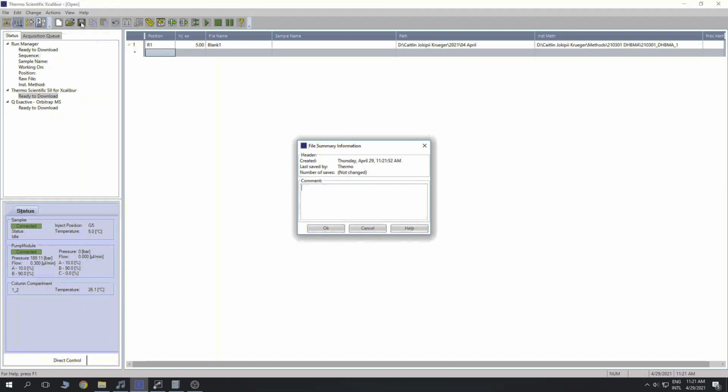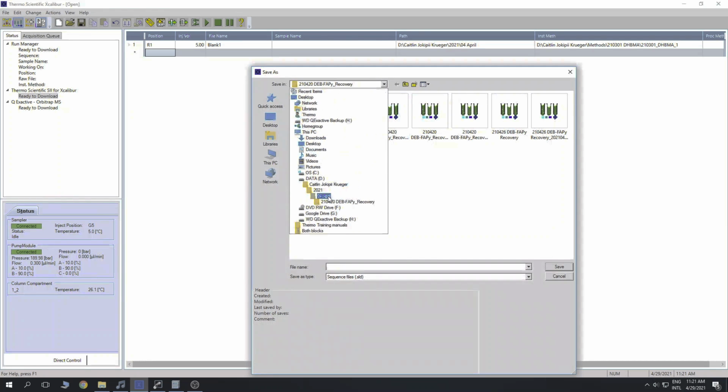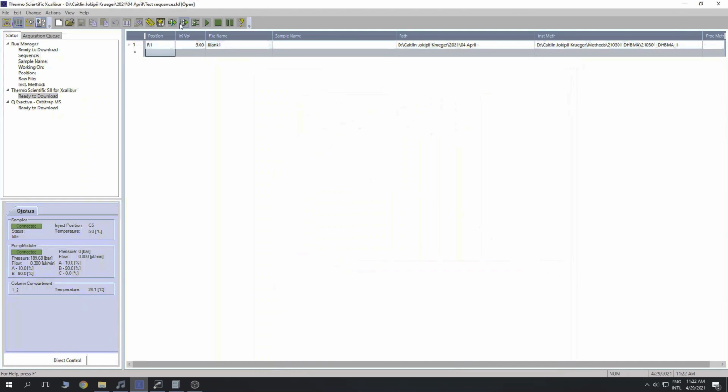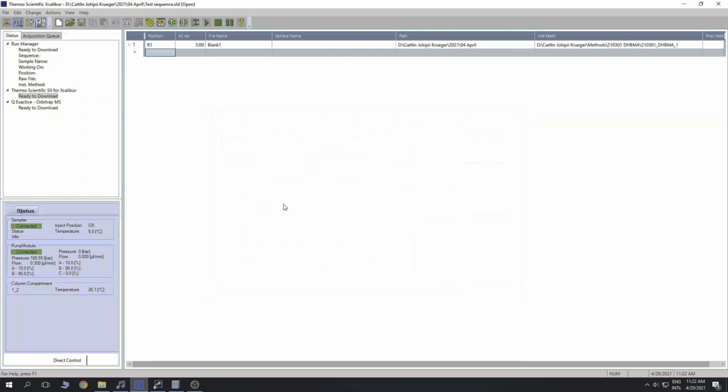When you have your sequence completed with everything in it that you need to run, you'll want to make sure you save it as a new sequence and save it in the same place where you set your data path. And then you'll want to hit this Run Sequence button. This will open up this window. You'll want to double check that you're running the rows of the sequence that you think you should. Right now my sequence only has 1, but if you have 10 samples or 20 samples, make sure that this says what you think it should. And then hit this OK button to start the sequence.